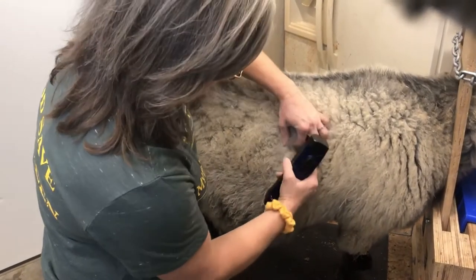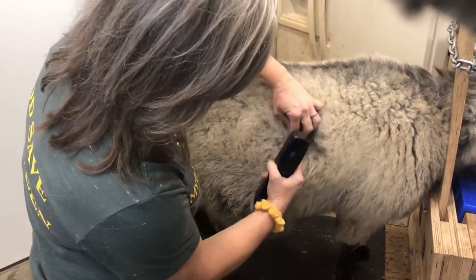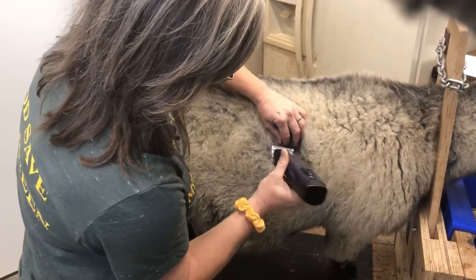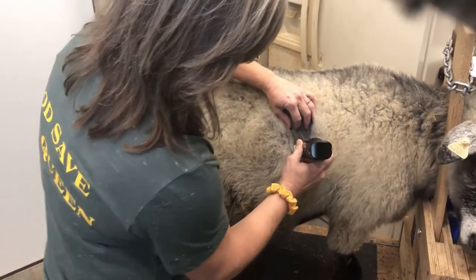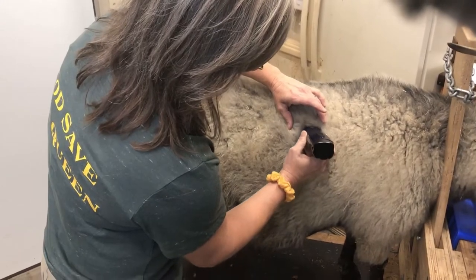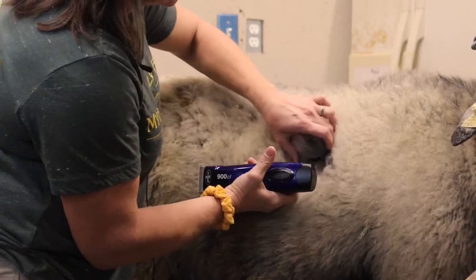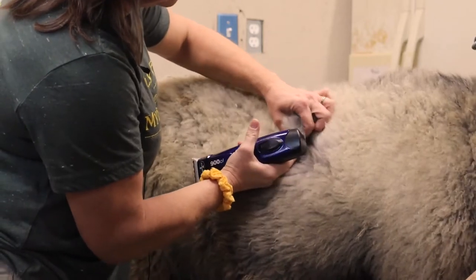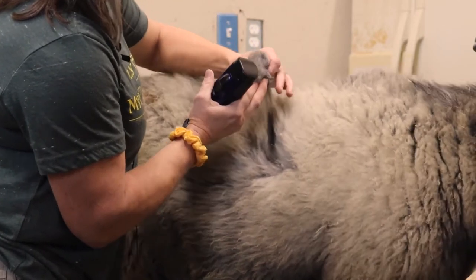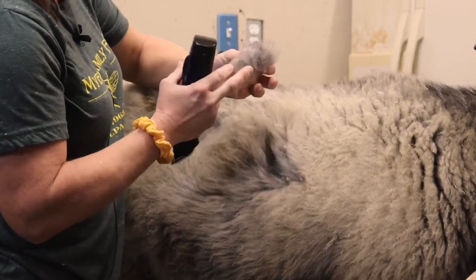We're going to go in and find where the skin is, then lay the clippers next to the skin and go up approximately two inches. Then we're going to gather the sample, trying to keep it in its original architecture with the cut side all together.